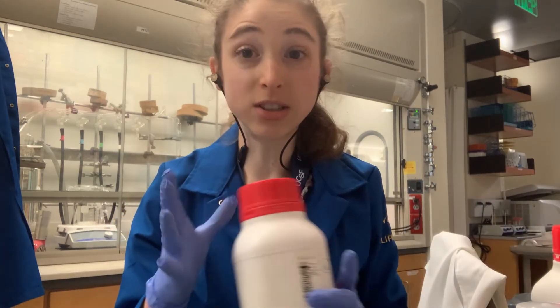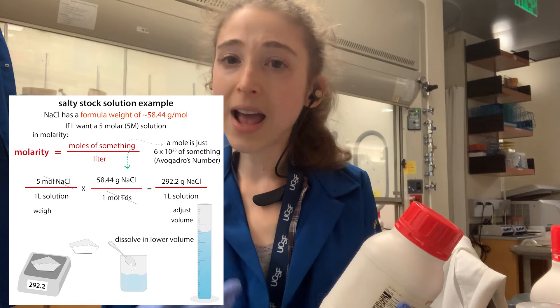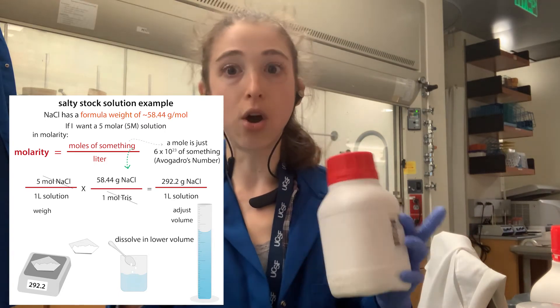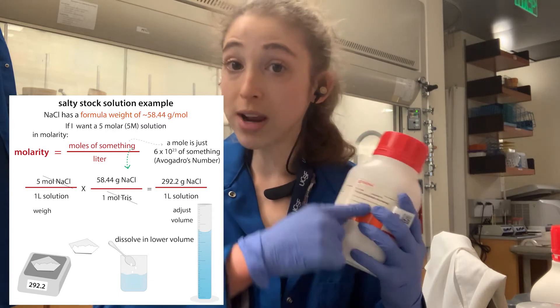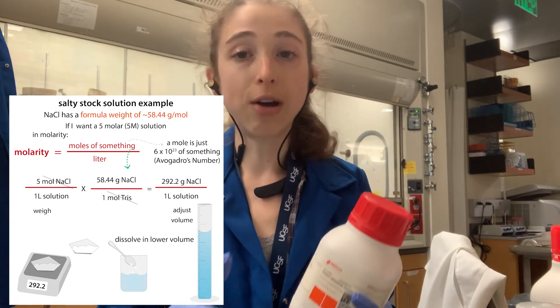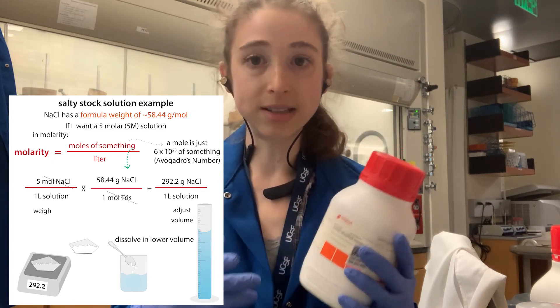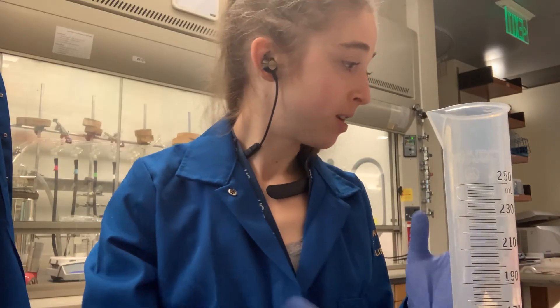Sometimes these solids come as a hydrate — they have water molecules associated with them, like a heptahydrate. Those water molecules add to your formula weight. So if the recipe was calculated for the non-hydrate form, or a different hydrate form, the formula weight will be different. Look at the bottle to make sure you're using the right formula weight, so that if you have a heptahydrate, you're accounting for those seven associated water molecules. The formula weight accounts for this so you know how to measure out the correct number of grams to get the same number of moles of the part you care about. I hope that helps with your solution making — happy recipe baking!